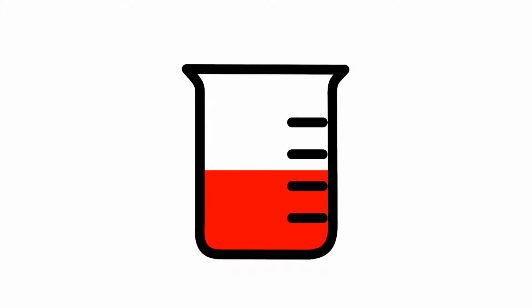Imagine if I have a beaker full of a red solution. If I'm in a room that's other than dark, some light is going to shine through this solution. The light that passes through the solution is going to be detected by my eye. I'm going to see it as red or blue or whatever. My eye is basically doing the same thing that a spectrophotometer does. I'm detecting the light that passed through a solution.